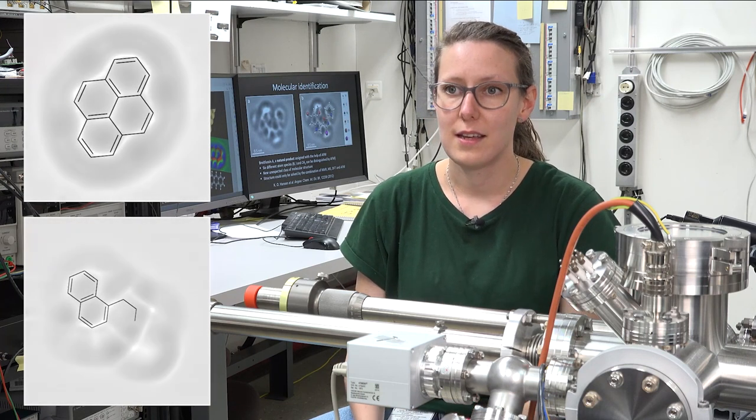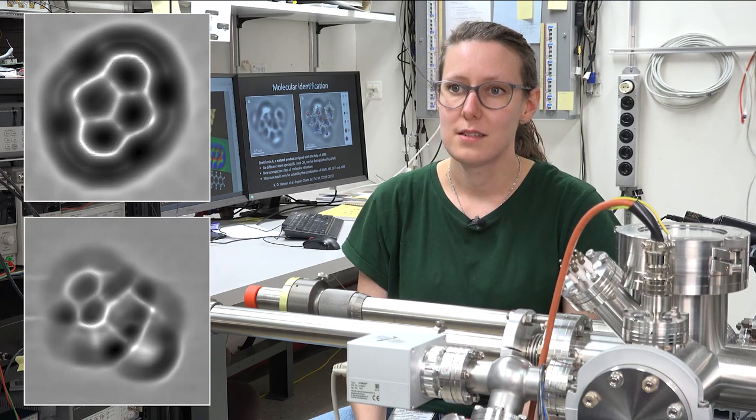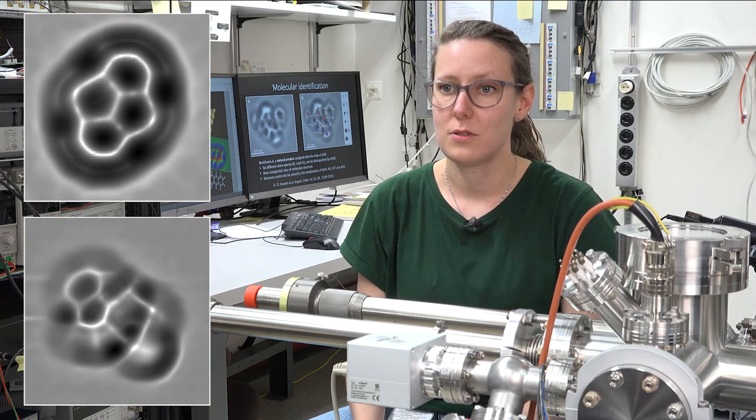That's how we then, in the end, really could have a look at single molecules from a meteoritic source. We got a sample of the Murchison meteoroid from NASA, and this we investigated using our low temperature AFM.